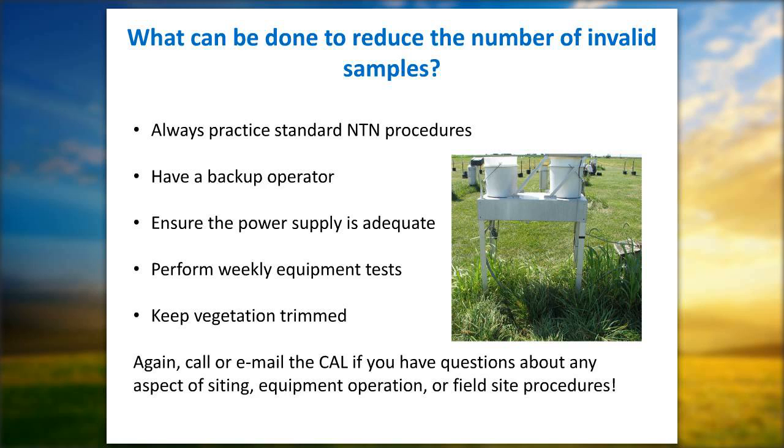How to prevent leakage? The question was specifically, is bottle leakage getting less frequent across all sites? And yes, in general. We've tried about everything. You'll see the note on the field form to try to tighten the bottle. We found sometimes they can be over-tightened and that could cause an issue. We are putting new bottles into the system. Some of you probably noticed them by now. They have a green dot on them, and that's to mate up the proper lid with the bottle.